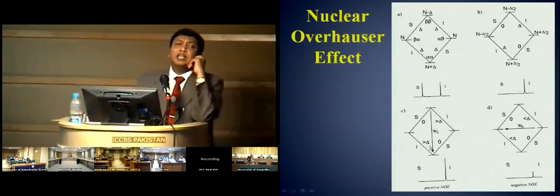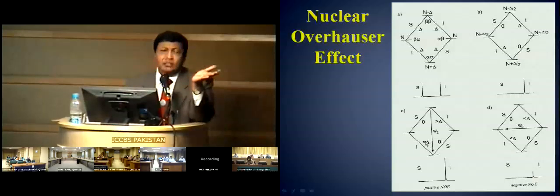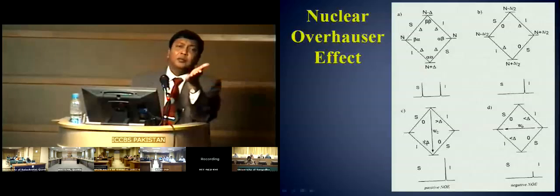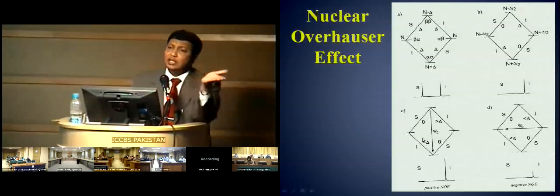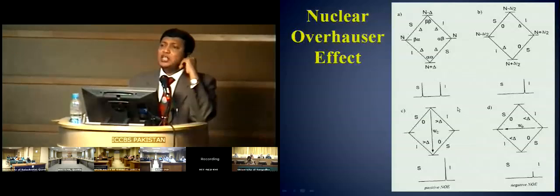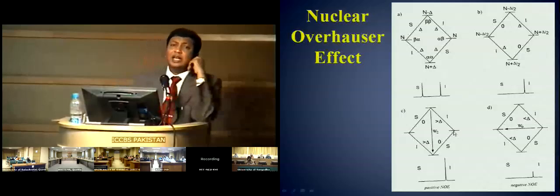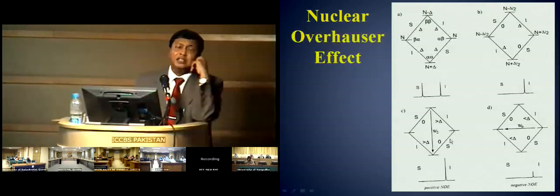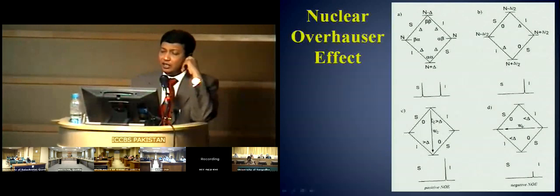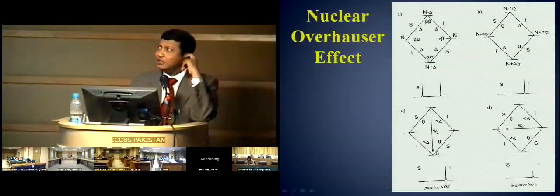What has happened is that by saturating S, pumping energy into S, you have forced a relaxation mechanism which is normally not allowed, not operational in case of single radio frequency pulses, right? It only becomes operational when the energy of the system is unusually high. And when the energy of the system is unusually high, that triggers a relaxation which is a forbidden W2 relaxation.